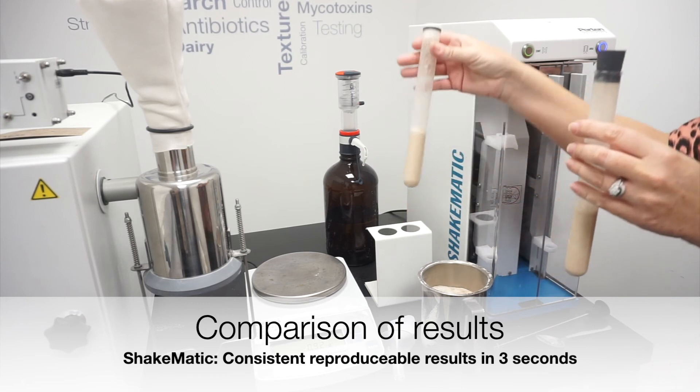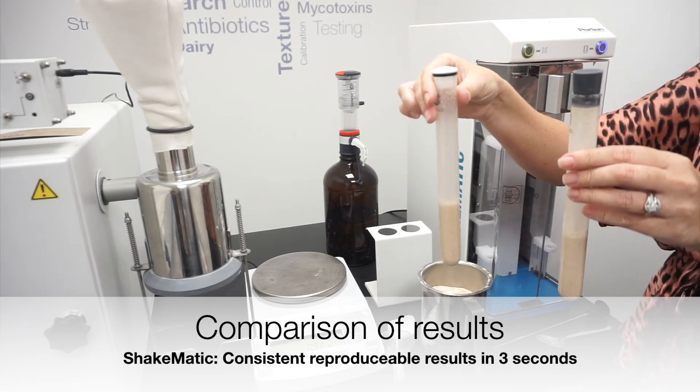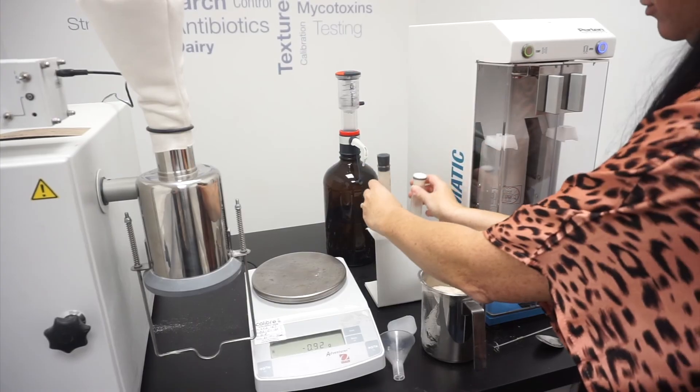The Shakematic will provide a homogeneous sample mix every time, regardless of operator.